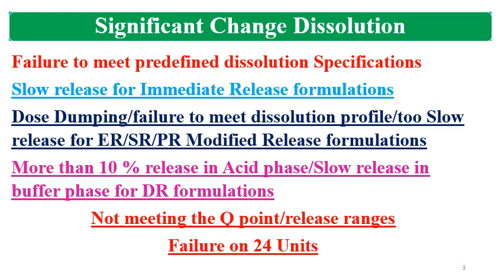So you might have learned about the S1, S2, S3 criteria or L1, L2, L3 criteria, when you can say that my dissolution is failing. If you perform the dissolution testing on S1 stage, you cannot say that it is failing. You can go to S2 stage. If it is failing there, then you can go to S3 stage.